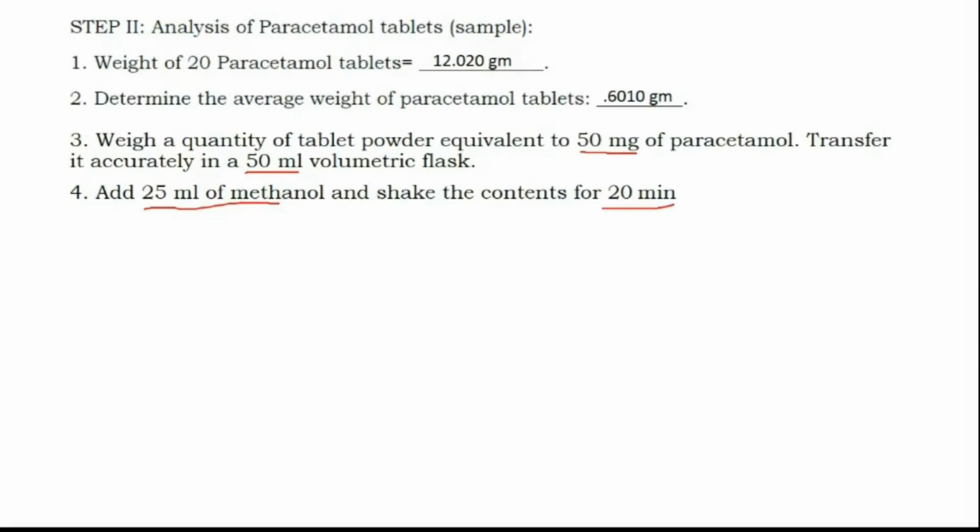Any guesses what is the role of methanol? Extraction, yes. So yes, both answers are right. Methanol is acting as the solvent for paracetamol. So paracetamol will get extracted from its excipients into the solution. I hope you understood this part. Okay. Now we are going to make up volume to 50 ml.